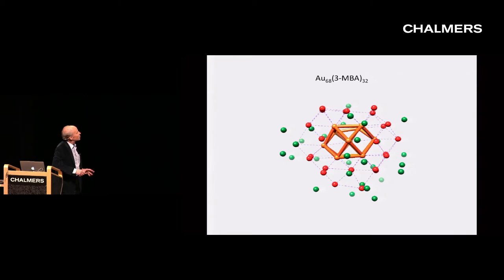We have gone on to solve such structures of many of the other gold nanoparticles, and I find the results absolutely fascinating, and I'd love to spend the rest of my time and that of the following speaker telling you about it. But I thought in the remaining minutes I would return to what was the original objective from long ago, and that was to improve the resolution of cryo-electron microscopy, and in particular to solve the structure of that very large RNA polymerase II pre-initiation complex.